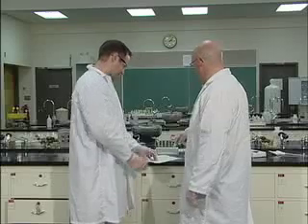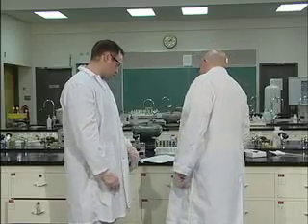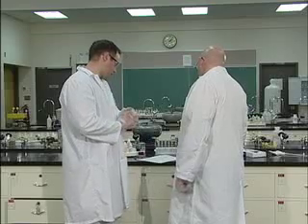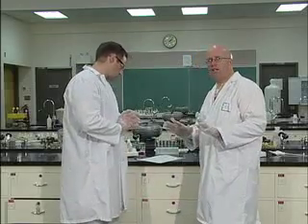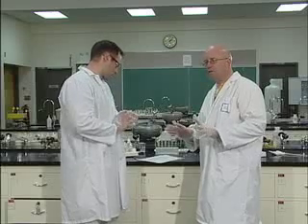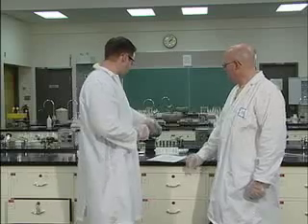Now, do we have to do some litmus testing on these ones too? At this time, no, you don't. I don't believe you have to do litmus on this one. So we're observing any precipitate or flocculant that happens and any temperature change. Yep. Okay, good. So the last step is D.